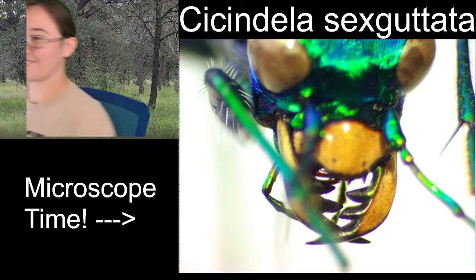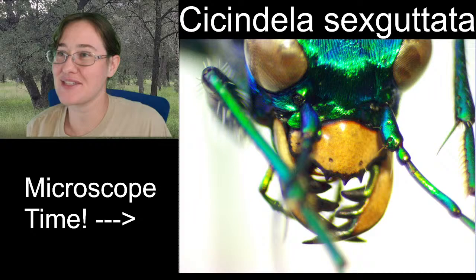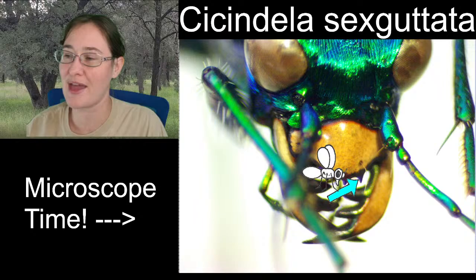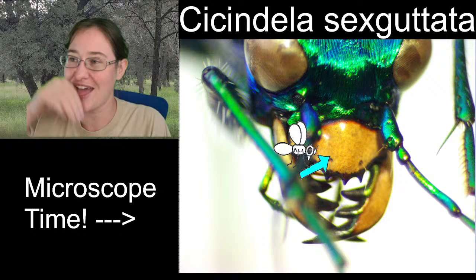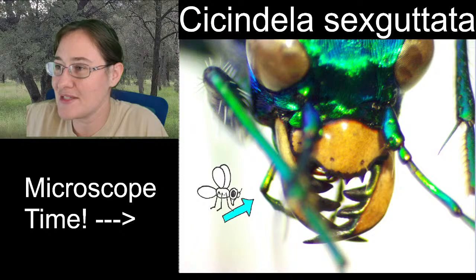Check out those mandibles. That's wicked. So that yellow piece, all right, so this is what we're looking at. This is the edge of the head here where you can see the metallic green-blue ends. That's the edge of the head. This piece here that comes around, there are actually three spines coming off of that, and you've got two spots with hairs on them. That is the labrum. That's our upper lip. Then you have this fella here and that fella there. Those are your mandibles. And if we zoom down just a little bit, we can see right here this sclerotized piece that's also metallic green-blue.